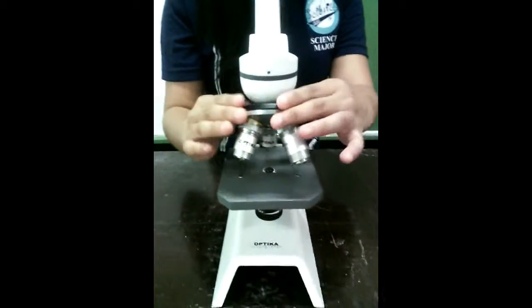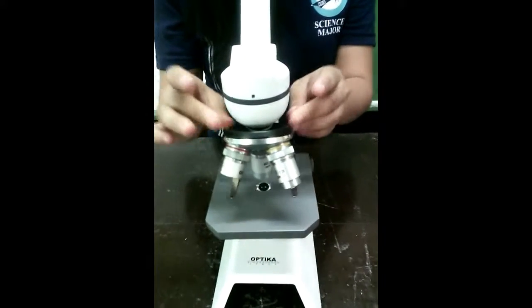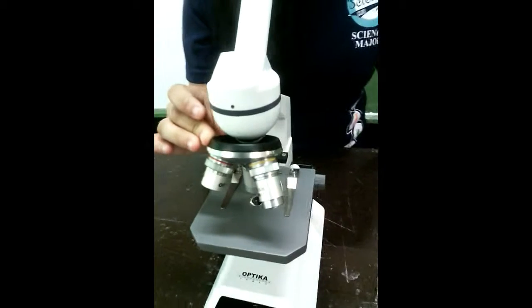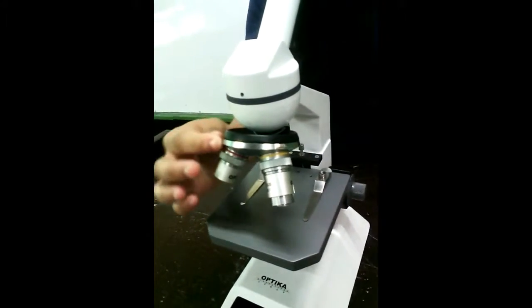The revolving nose piece is where the objectives are secured. Turn to select the appropriate objective. The lenses must be clicked in place for the field to be visible.